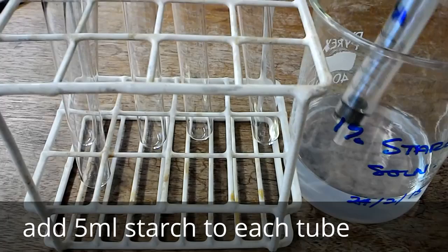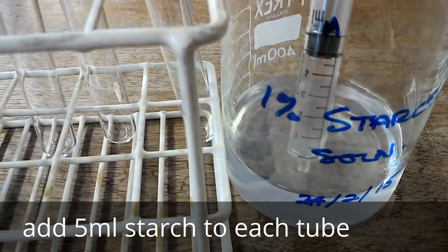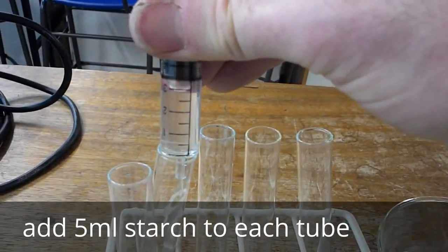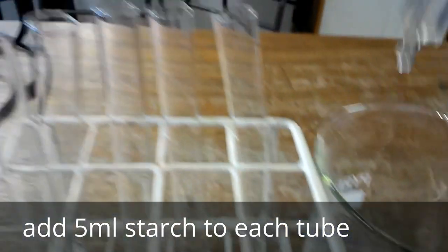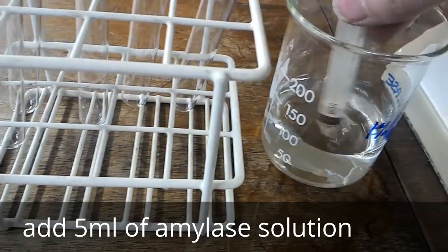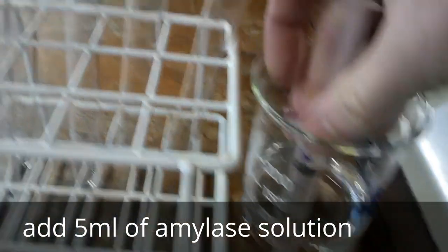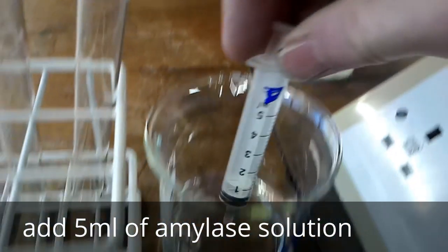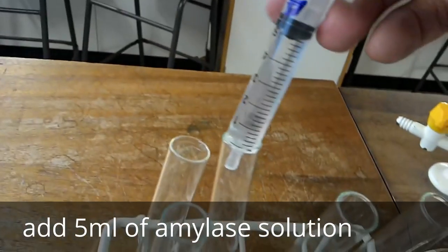Next, pipette 5 cubic centimetres of the starch solution into each of your 5 tubes. And so on. So repeat the same thing for your amylase solution, 5 cubic centimetres for your 5 tubes. Yeah. So complete that for each of the 5.